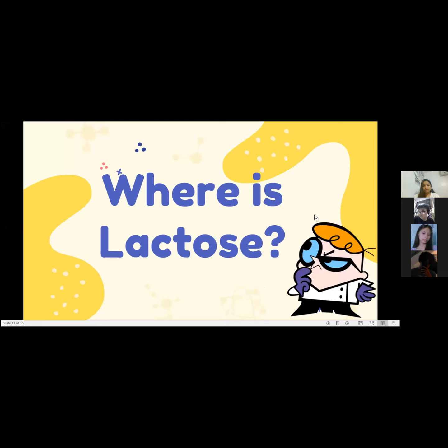Now, as you may have noticed, in our virtual lab we only had 3 solutions. The solution lactose was not mentioned in our virtual lab, but if you conduct the Fehling's test using the lactose solution and follow the procedure correctly, the result for lactose will be a positive Fehling's test because lactose has reducing properties.